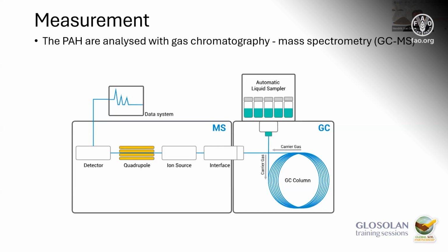Yes, well, it's a practice that is applied everywhere in organic analysis, because in organic analysis we can make use of isotope labeled internal standards. That means that the compound has the same structure, but some atoms like hydrogen are replaced by the isotope deuterium. So in fact, the compound behaves equally to the non-deuterated compound.